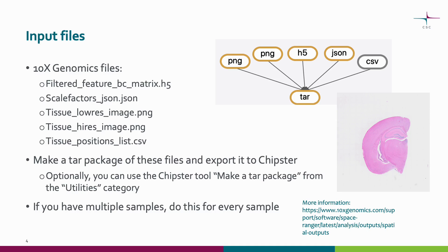The PNG files contain downsampled versions of the original full resolution image. And finally, the CSV file contains a table with rows that correspond to spots. As mentioned, these files need to be in a tar package, which you can also make in CHIP-STIR using the tool make a tar package.